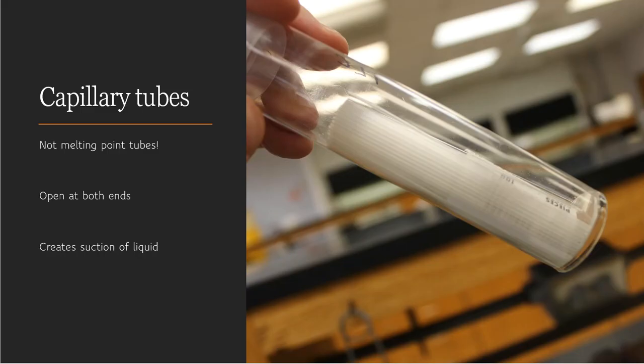To spot my samples onto this plate, I need something we call a capillary tube. So here is a capillary tube, and they are not melting point tubes. Here's the difference. Melting point tubes are very long and narrow, just like capillary tubes are, but they have a closed end at the bottom. That closed end is to hold your solid sample so you can do a melting point on it. A capillary tube is open on both ends.